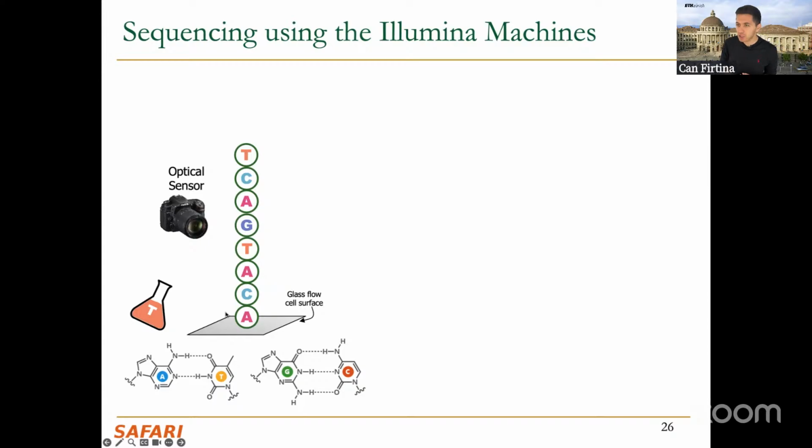And this is ensured so that it doesn't connect to this A or some other A, because the base over there is designed in a way that the T and A connection should be made over here, because there's a particular chemical connection here, such that it won't happen here, but it will happen here. So we know that chemical connection type, and that's how we ensure that this T will bind to here.